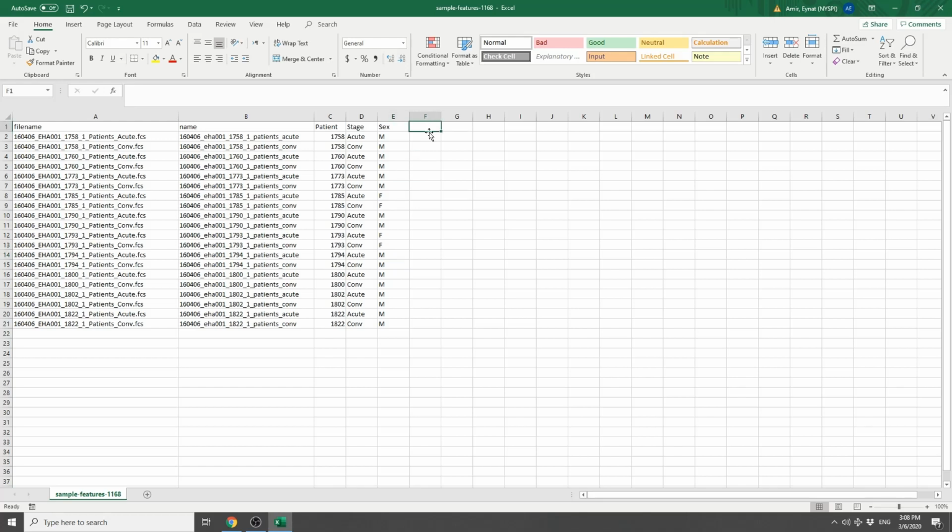And finally, it is possible that the infection behaves differently between males and females. Unfortunately, we don't have enough female patients to do any meaningful analysis, but we might want to remove them from some of the analyses. So I'm going to define a new column called M stage. And it's going to be the same as stage. However, it's going to have NA values for the female patients. And this means these columns will not be included in the analysis.